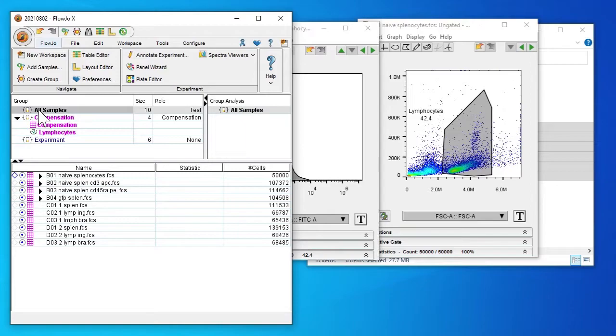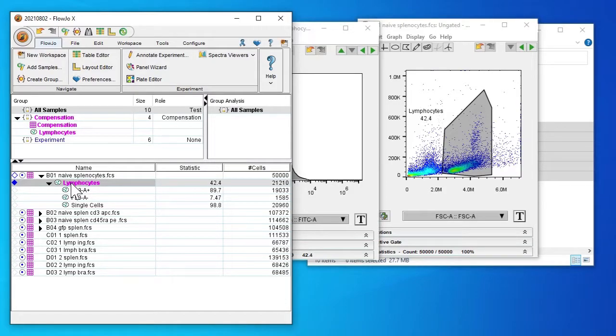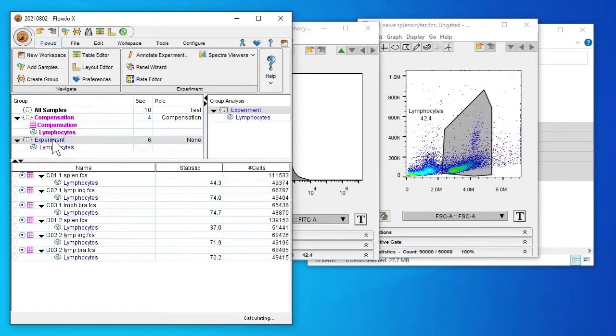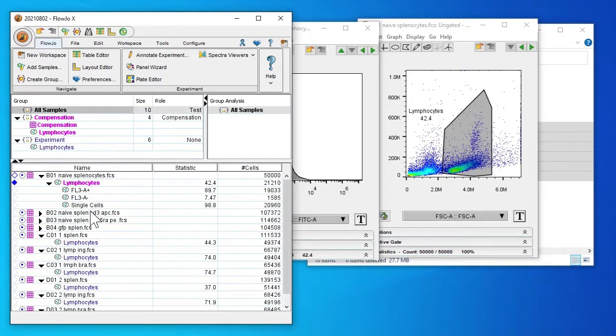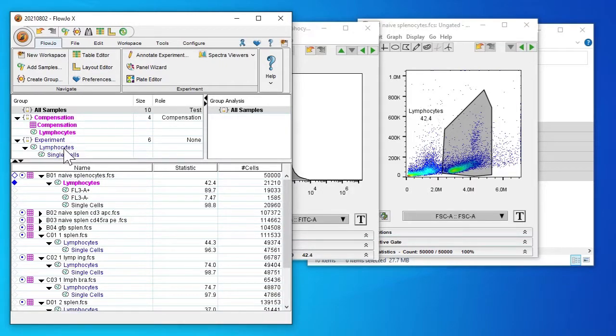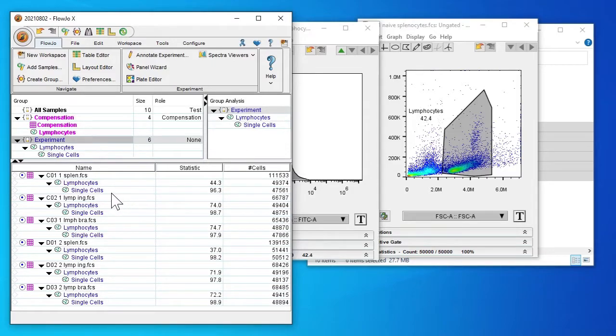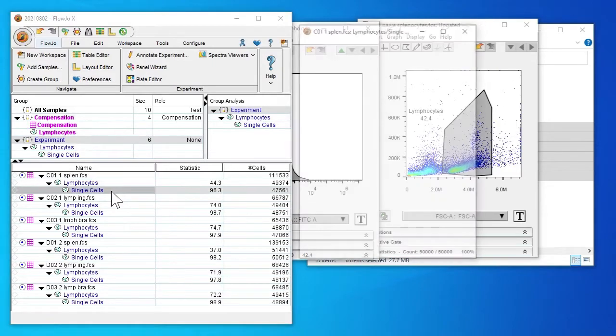You can see that our samples have been compensated as there is a pink square 3x3 square next to the cell samples. I'm going to take the lymphocyte gate and drag it to experiment so that all of our samples in the experiment group have lymphocyte gate. And I'm going to select the single cell gate and drag into the lymphocytes so that we can look at single cells in our lymphocyte group.